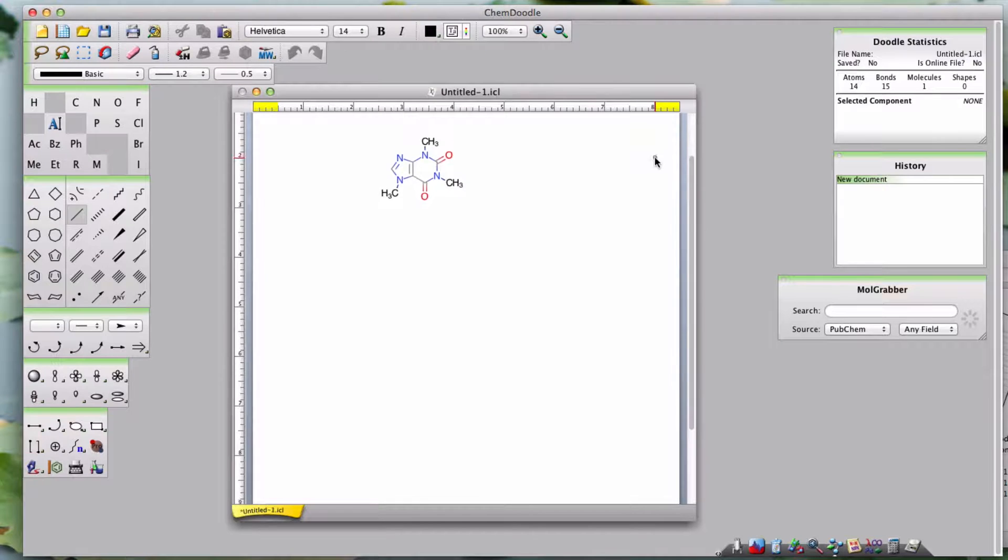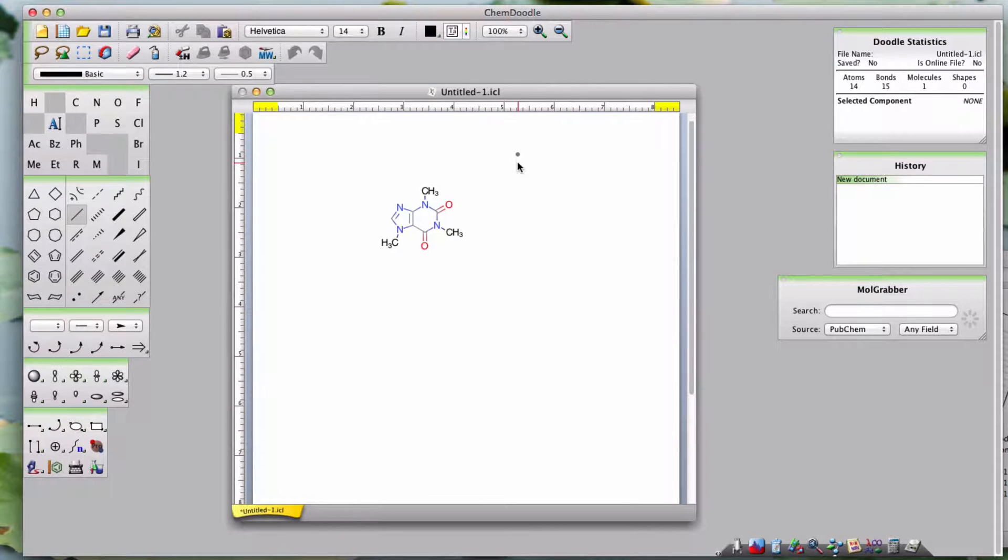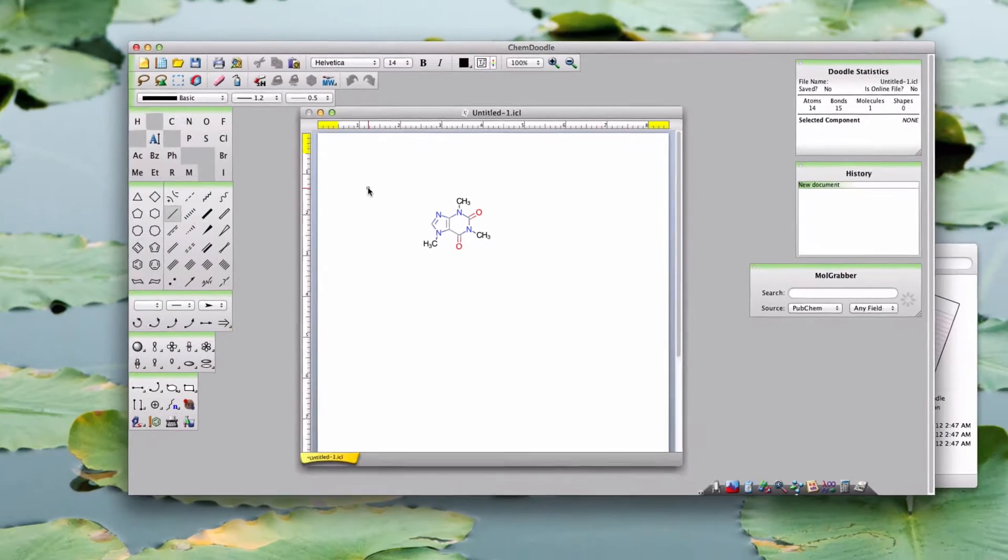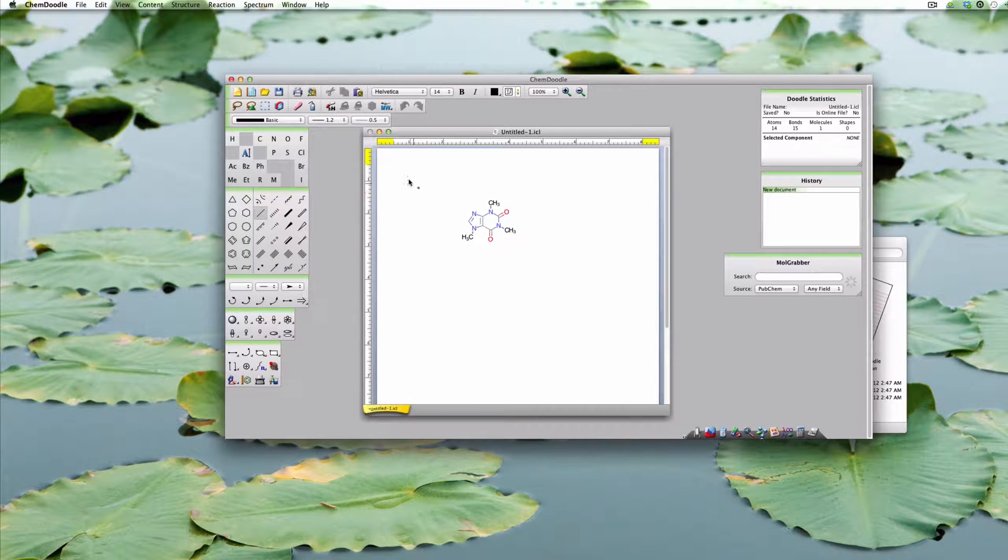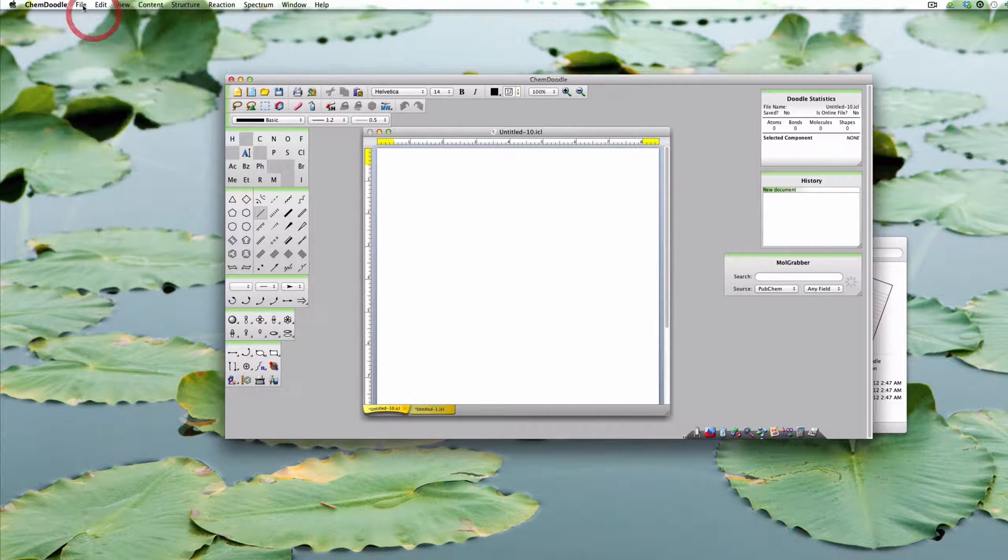You can only horizontally scroll on Mac OS X. Sometimes you'll want to work on multiple doodles, so I'm going to open a few documents and show you how to manage them.